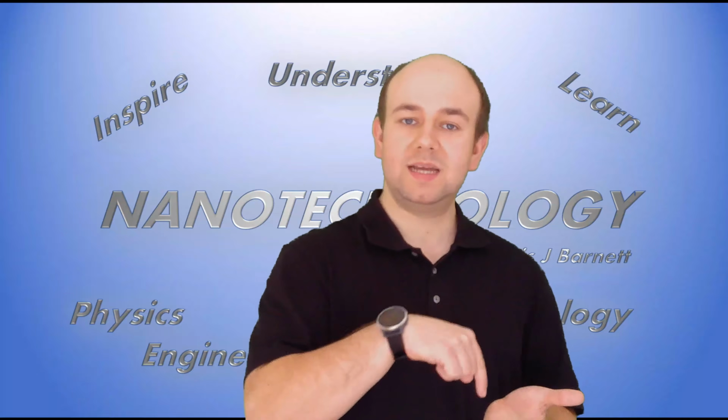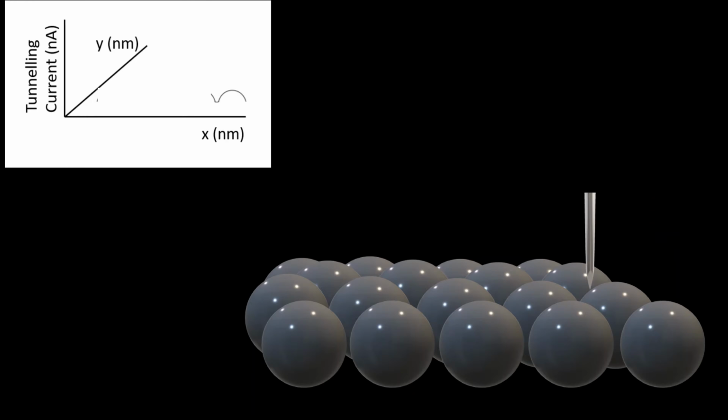What we can do with STM is move the tip down so it's within a nanometer of the surface, measure the current, and then as we move the tip sideways, we can re-measure that current and see how much it changed.